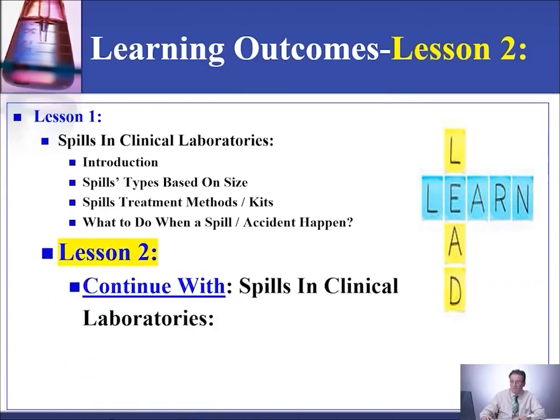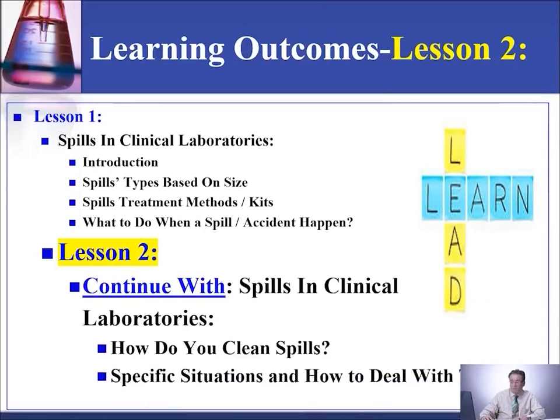In lesson 2, we'll continue with the subject, and we'll talk about how you clean spills in general, and then I will give you specific spill situations and how to deal with them.